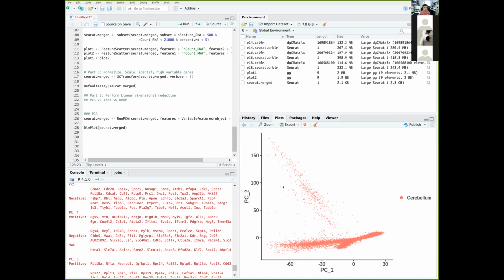You do see some orthogonal clusters going downslope here. You can try to figure out what these cells are if you want to find the features of these cells, but we're not going to do that. One thing that you realize from this PCA reduction is that cells are still very condensed.